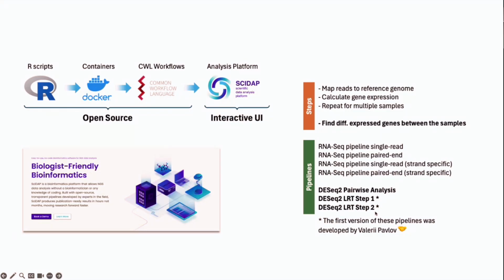Previously, the first version of these workflows was developed by Valera from our lab, and I refactored them and made them more convenient to use in SciDAP. SciDAP is the platform where we can run any analysis, either written by us or written by somebody else, as long as it is written in the form of a CWL workflow. And CWL is just a common standard for describing your workflows.